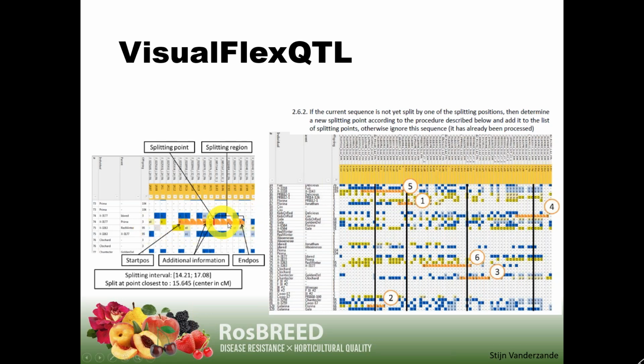So the recombination occurs over this interval. But for some of these markers, it has these S0s or S1s, which means there is some evidence that it's probably coming from the null chromosome or the 1 chromosome. And so it takes that information into account. And given that these are two nulls, it's saying most likely my recombination happened in here.